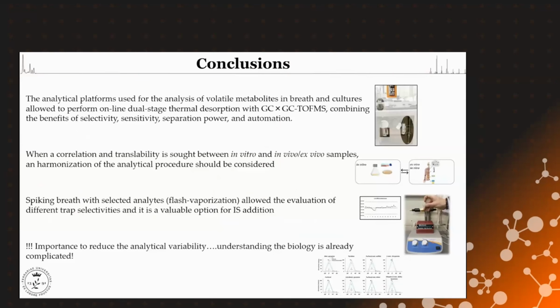And going to the conclusion, I showed you that the analytical platform we used for the analysis of volatile metabolites in breath and cultures allowed us to perform online, dual-stage thermal desorption followed by GCxGC-TOFMS, combining in this platform the benefits of selectivity, sensitivity, separation power, and also automation.